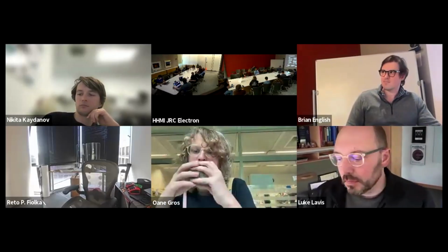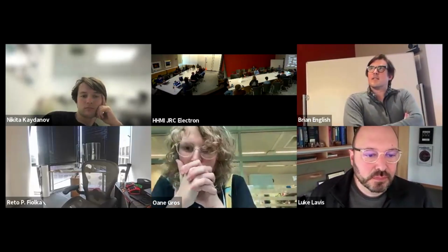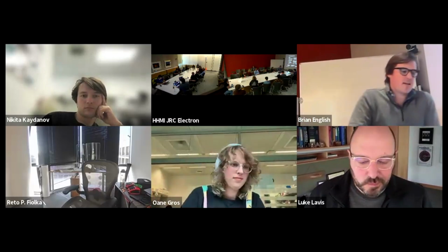Andy, can I ask you, first of all, beautiful. But what I find really cool is when you switch into FilaBuster mode, you don't see bleaching so much, but you see disassembly before bleaching. Yep. So that to me, I mean, Luke's on the call as well, but to me, it speaks that you only need a minute amount of dyes to generate the ROS, right? You don't need all of them to make the damage. Or is that a right interpretation? Or how do you see this?